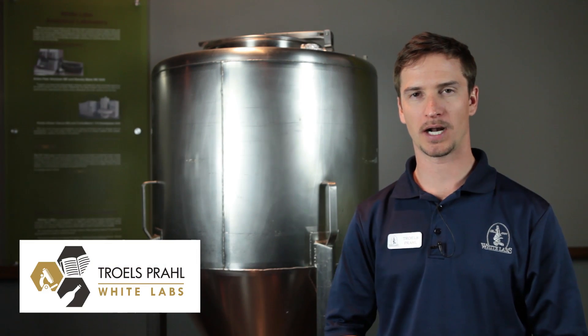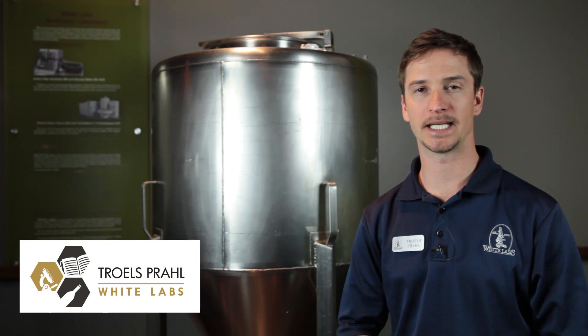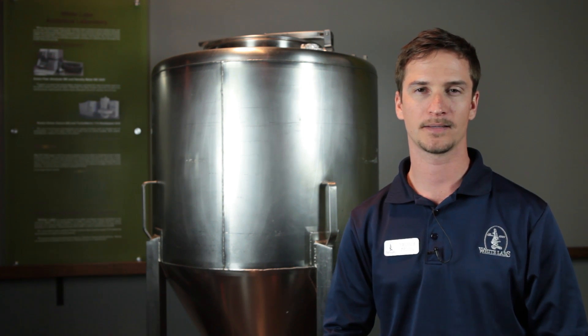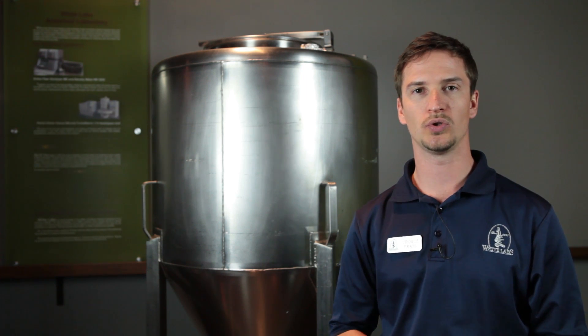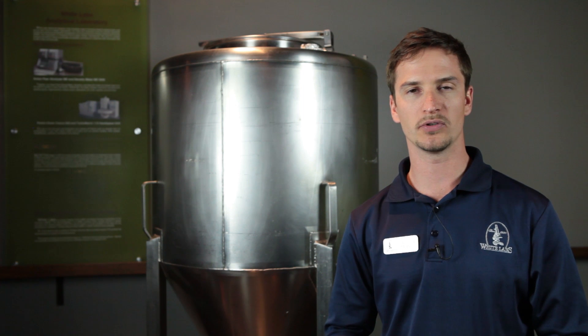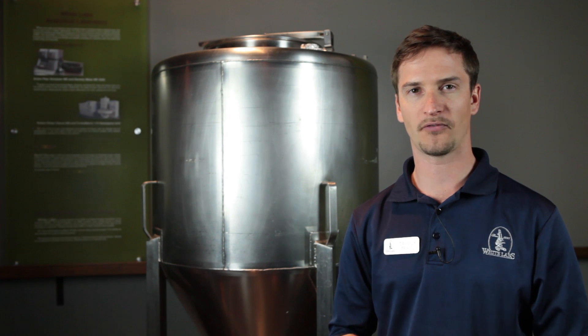Hello, my name is Troels Prahl. I work at White Labs as a yeast and brewing application scientist, and today I will tell you a little bit about the White Labs firm flask. The firm flask was designed several years ago to allow brewers to harvest, store, and reuse their yeast slurry from one batch to the next. I will explain a few of the basic features of the firm flask in the following video.